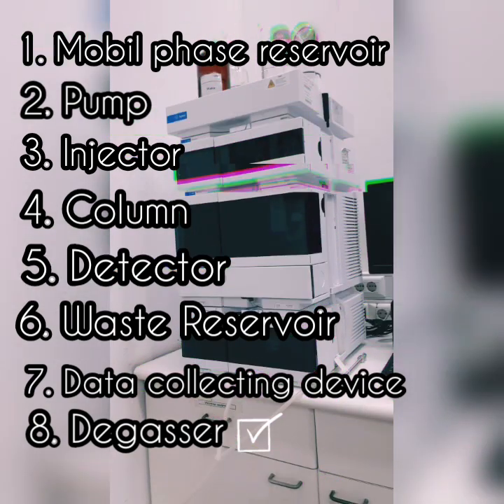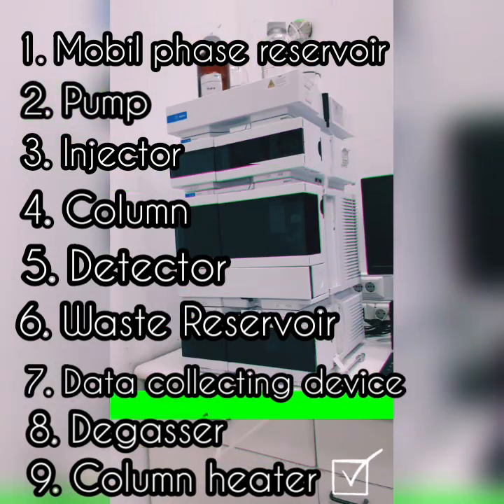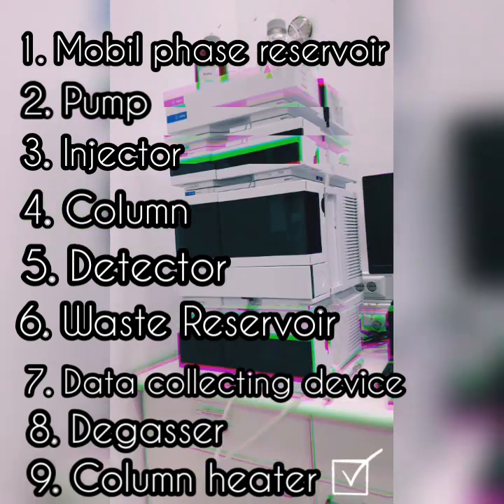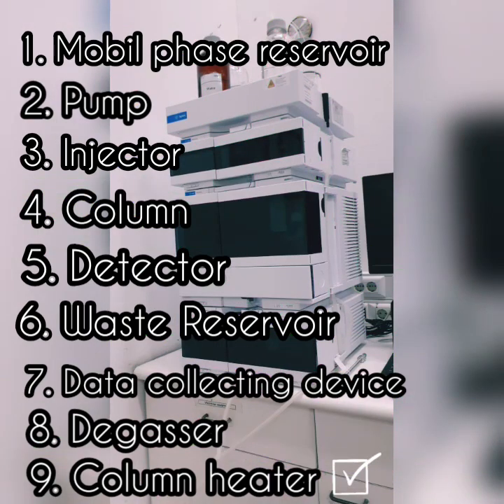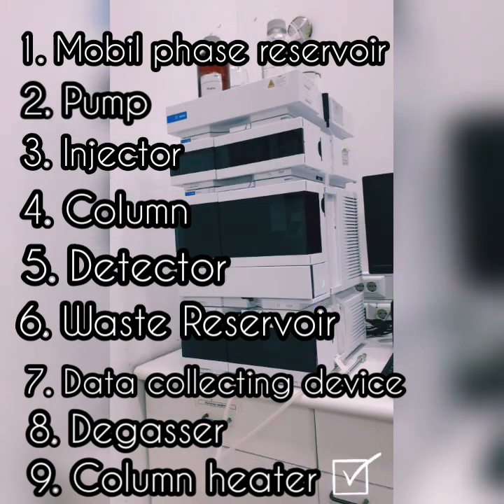The additional instrument others is column heater. The LC or liquid chromatography separation is often largely influenced by the column temperature. In order to obtain repeatable results, it is important to keep consistent temperature conditions. Also, for some analysis, such as sugar and organic acids, better resolution can be obtained at elevated temperatures, 50 to 80 Celsius degree. Thus, columns are generally kept inside the column oven, column heater. Okay, this is the instrumentation or the part of HPLC in general.